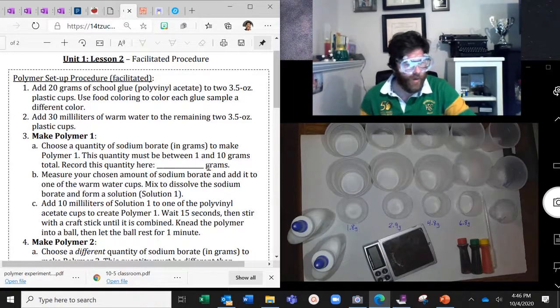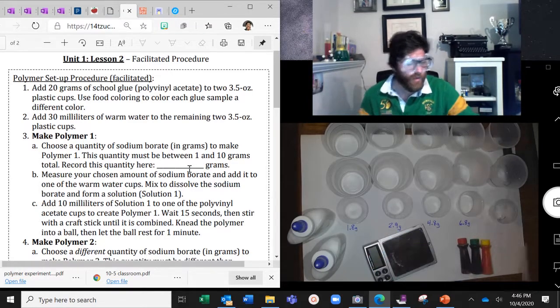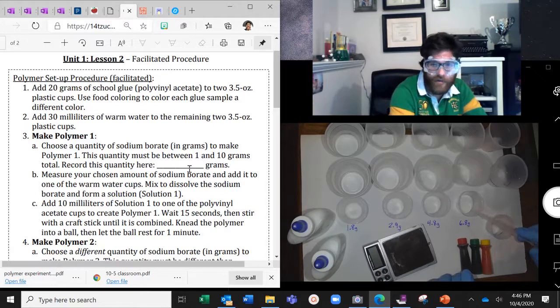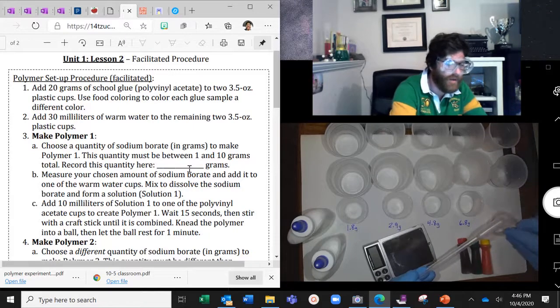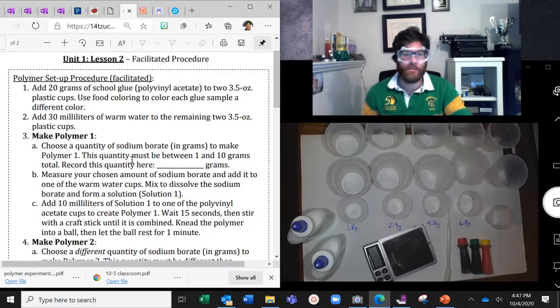Okay, then we're not going to mix the whole 30 milliliters of our solution in there. We're only going to take, using our pipette, 10 milliliters of that solution, right? So this solution will be the strongest, right, because it has the most amount of the borax in it, even though we're adding 10 milliliters of the solution. We don't want it to be extra watery or anything like that, but it will be stronger because it's got more of this concentrated in there, and so on and so forth, right? So that's what we're going to be doing.